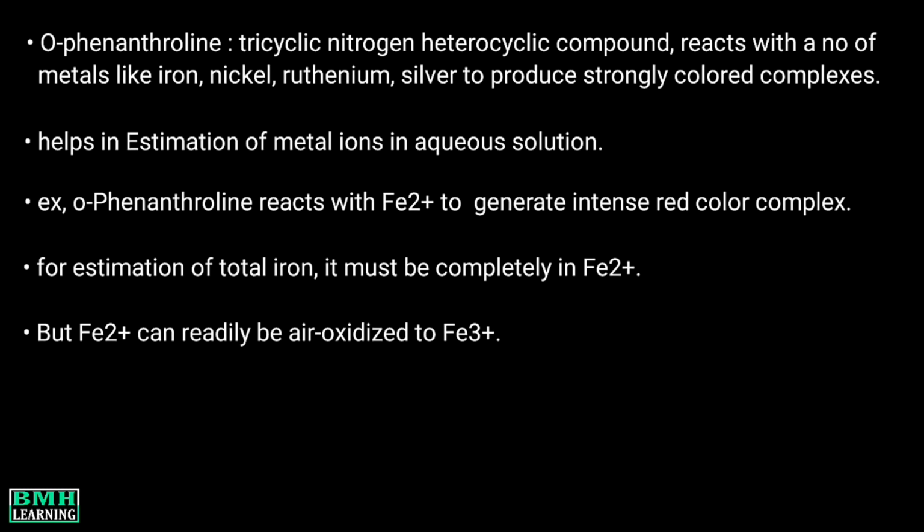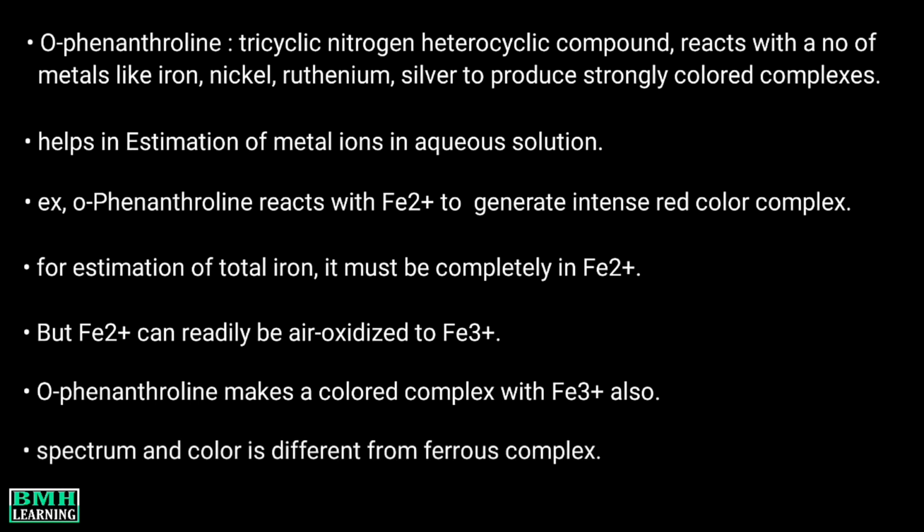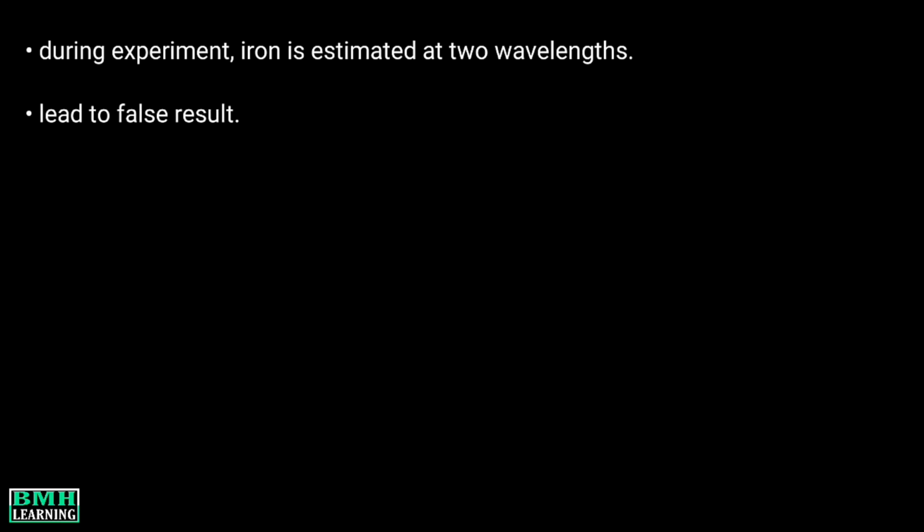Now the thing is that orthophenanthroline is going to make a colored complex with the ferric state also. But the spectrum of this complex is different from that of the ferrous complex. Also, the color is not as deep as seen in the case of the ferrous state complex. So while doing the experiment, you would actually be estimating iron measurements at two wavelengths. That means this would lead to a false result.